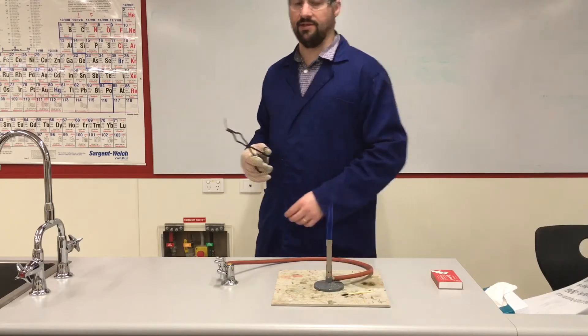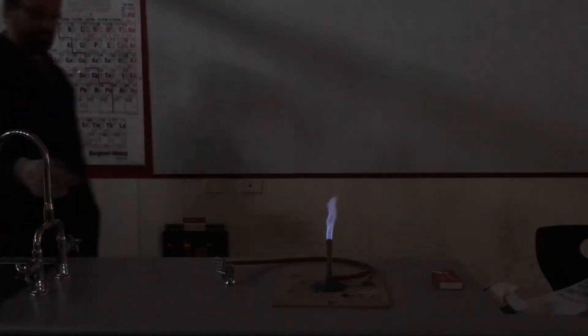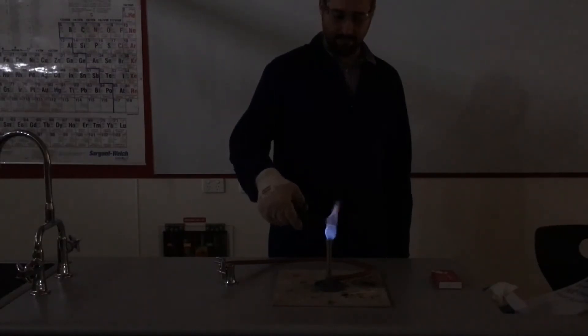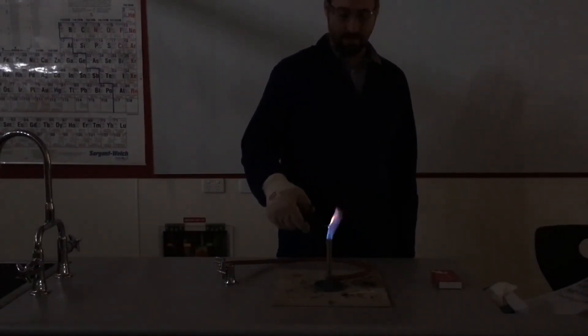Okay, now I'm just going to turn the light off. Okay, now we're going to heat up our magnesium.